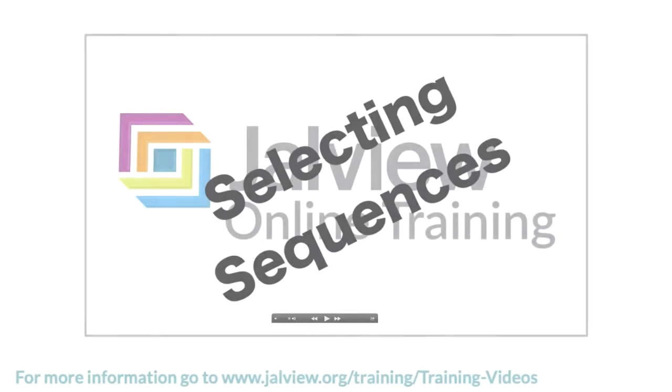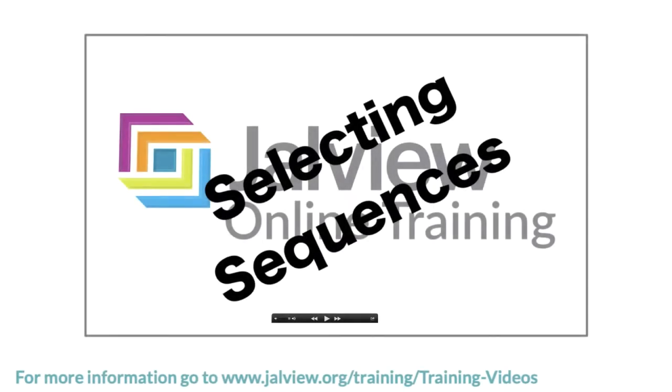In the previous video I demonstrated different ways to select residues and sequences. This follows on from that exercise.